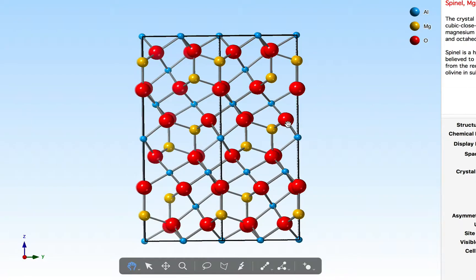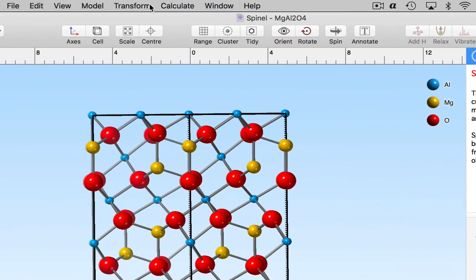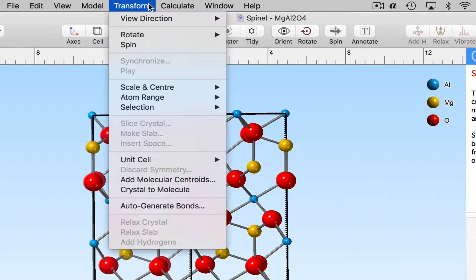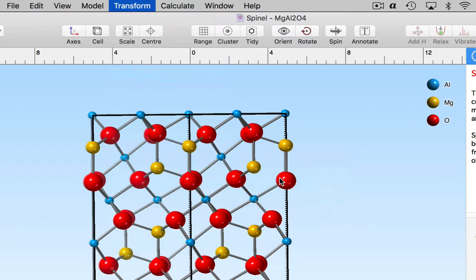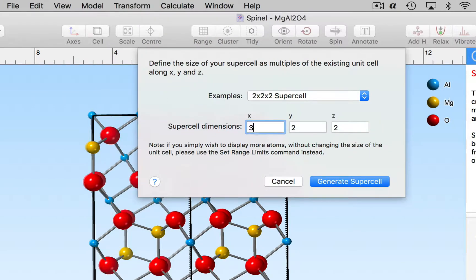Now in order to make my molecule fit I still need to make this slightly bigger. I'm going to make a supercell so that there's room for the molecule. We'll go back to the unit cell command and this time we're going to generate a supercell. I'm going to make a 3 by 3 by 1 supercell.